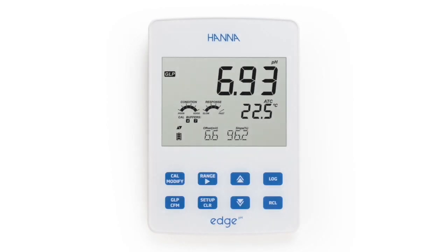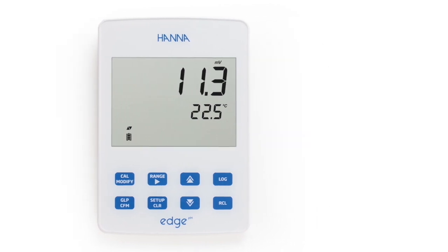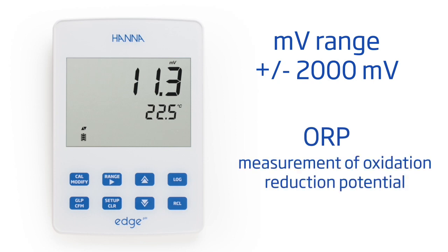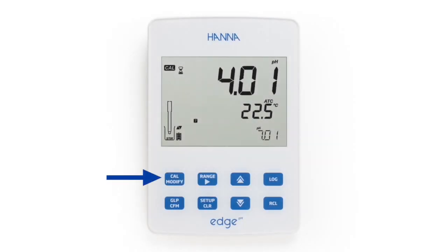Switching between pH and millivolt mode is made easy by simply pressing the range button while in measurement mode. The millivolt mode has an expanded range for the measurement of oxidation reduction potential with an optional ORP electrode. Pressing the dedicated CAL button allows users to enter automatic calibration.